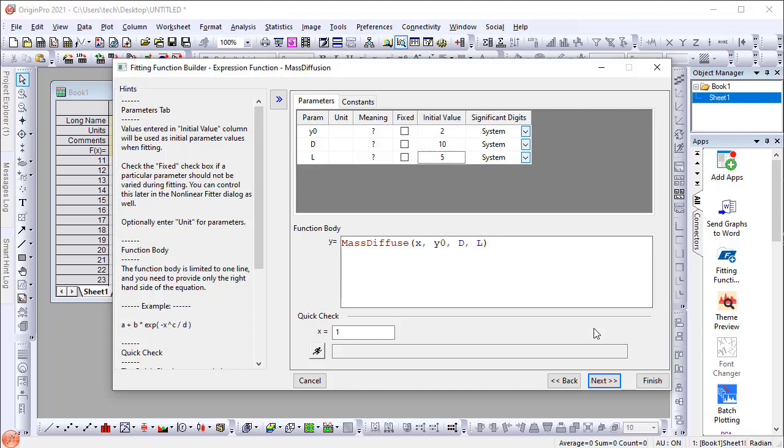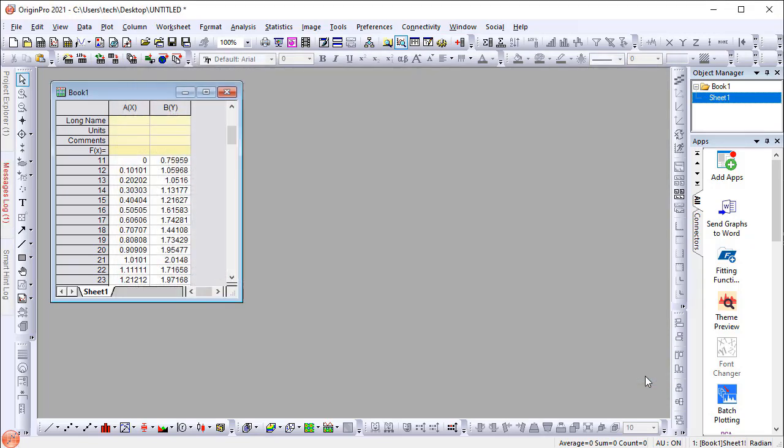This will create a fitting function file in your User Files folder. Next, we will add the Python script to the fitting function file.